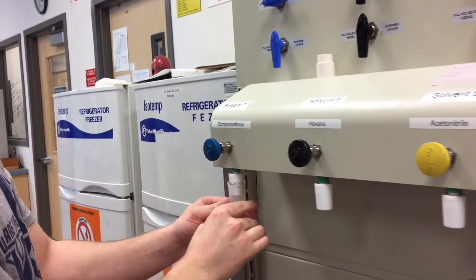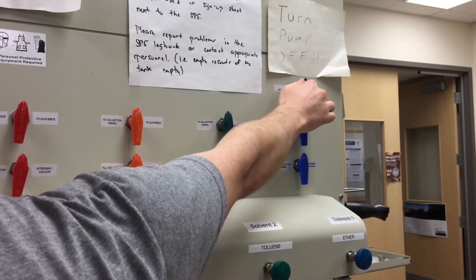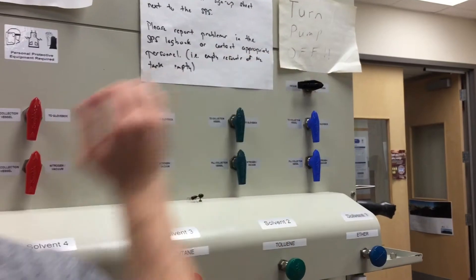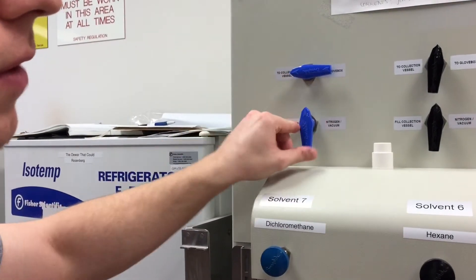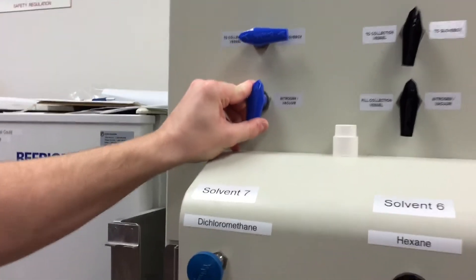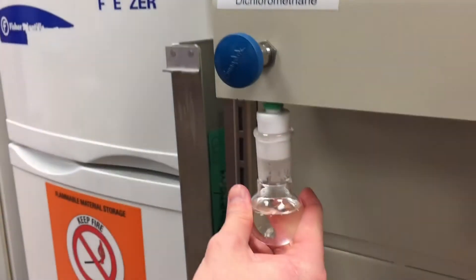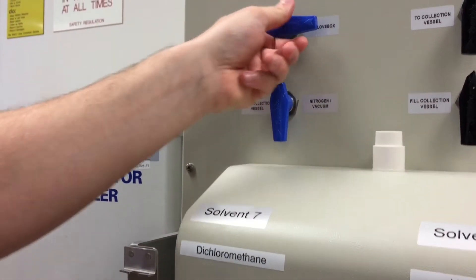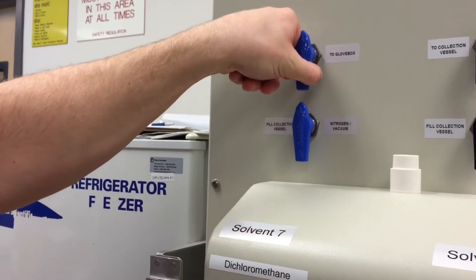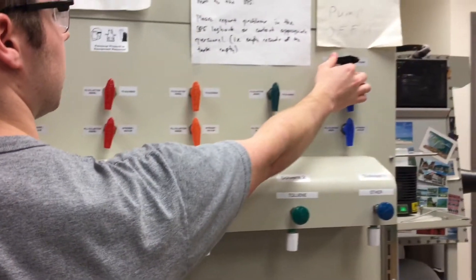Then you want to turn this back onto nitrogen, and turn this to nitrogen as well, because there is going to be some solvent still in the line and you don't want it to get pulled up by the vacuum. Now you want to close this and then close to the collection vessel, and then turn off and close this knob.